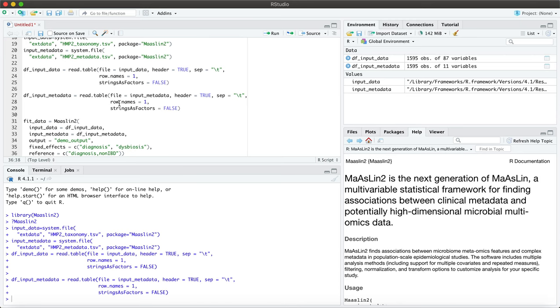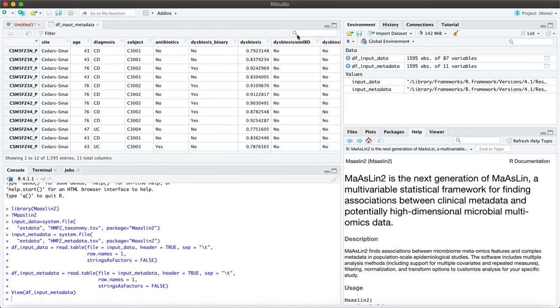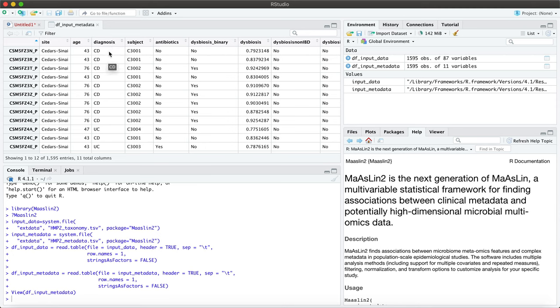If you follow the tutorial that's provided online, the associations of interest were done using your data or taxonomy file against two clinical variables: the diagnosis variable and the dysbiosis variable. As you can see here, if we actually go ahead and open our data sets or our data frames, these two variables represent both a continuous variable and a categorical variable looking at Crohn's disease versus ulcerative colitis.